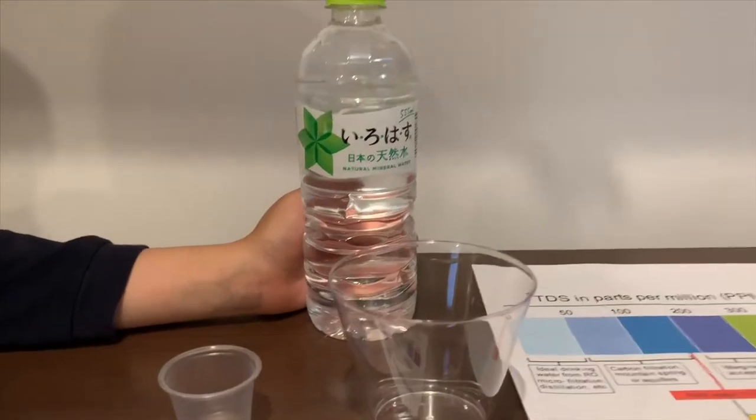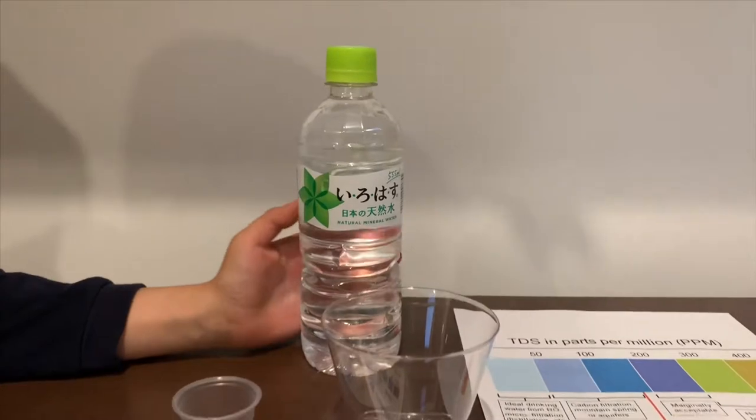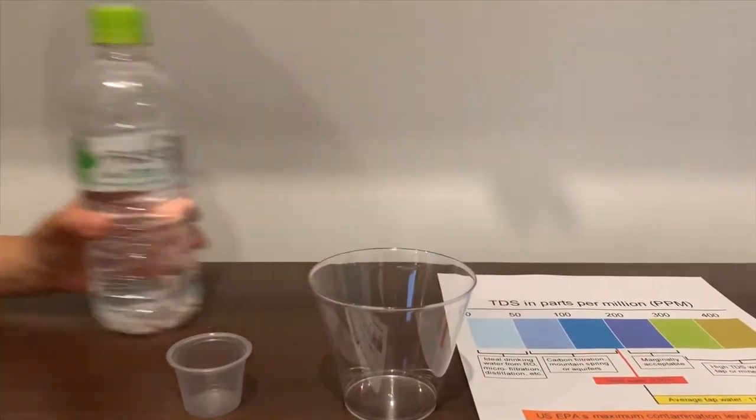This is Irohatsu Mineral Water. It's sourced from Japan and it costs one dollar. Let's test the pH and TDS levels.